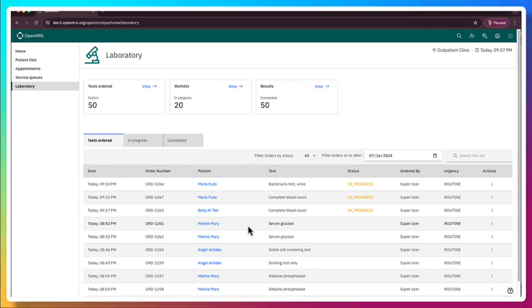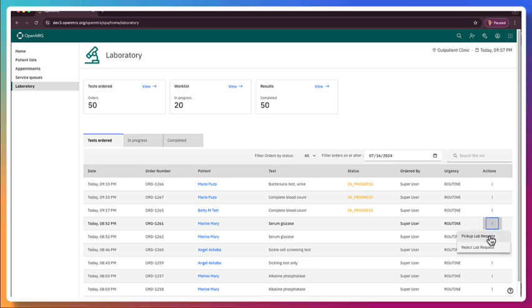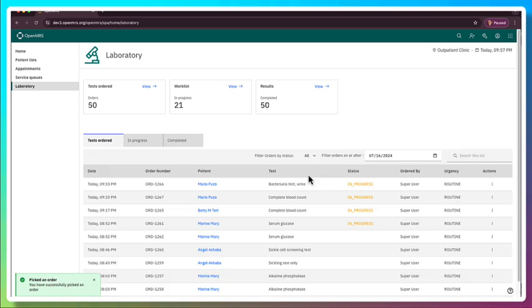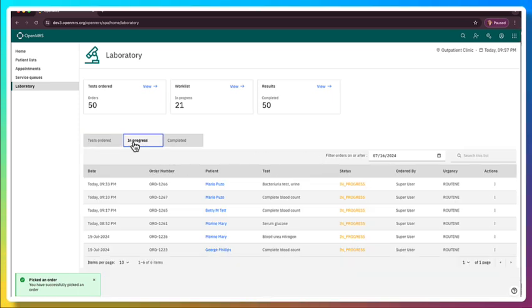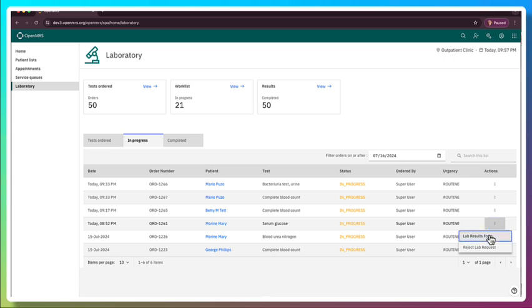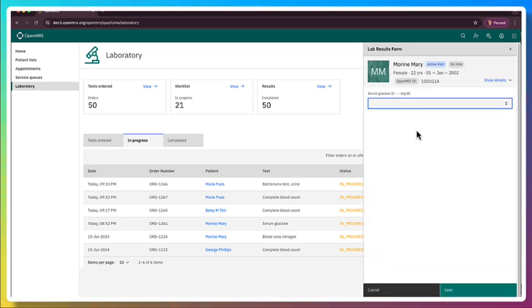For now, let's go ahead and we'll take the serum glucose. We'll say we are picking up the lab request. So that sets it to in progress and moves it to the next stage. So here you can see we've got the serum glucose here. We're going to go ahead and put in the lab results. And we'll say this is 50.